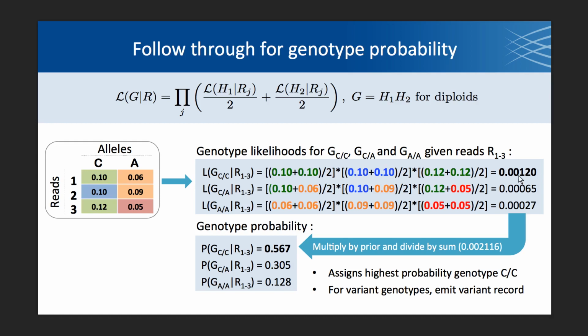But once we run it through the Bayes rule calculations, that's going to help us normalize our likelihoods so that we get posterior probabilities that add up in a way that we would expect. So across these probabilities, our highest is for the genotype CC. So that's what we're going to assign in the VCF, and we're going to output those probabilities as Phred-scaled likelihoods in the PL field.